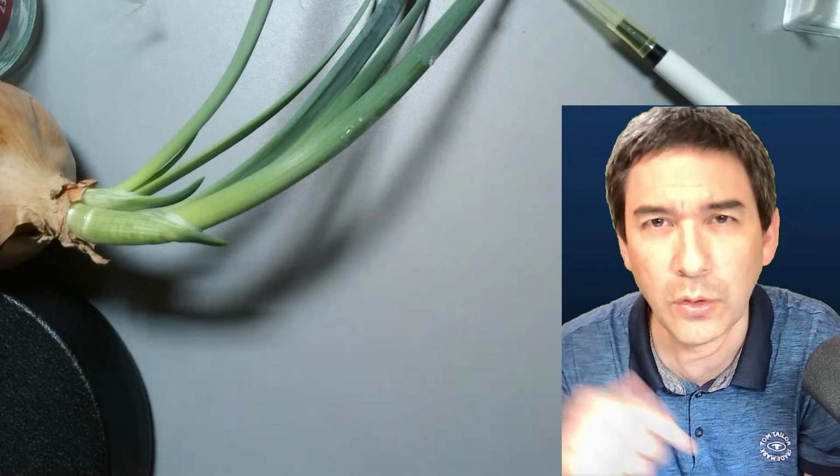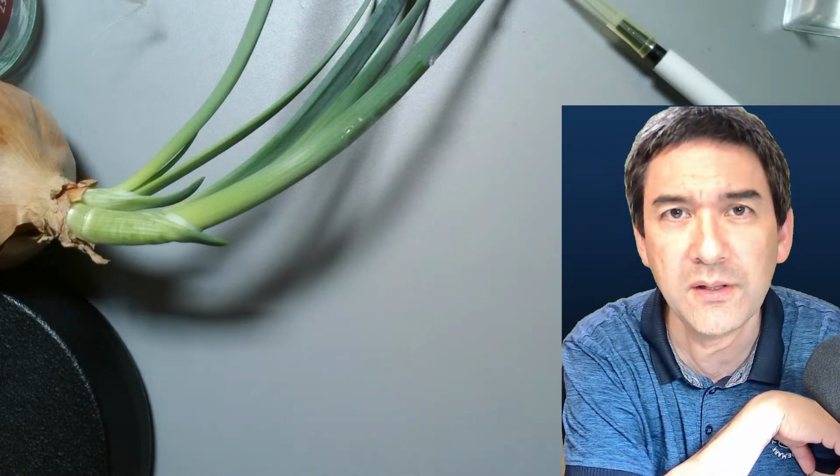Okay. What's a C-mount? A C-mount is a standard which is used for industrial cameras. Actually, it has a longer history than that. Yeah, but it is a standard for small size connections. Okay, you know what I'm gonna do, I'm gonna move on, if it's okay for you. And I hope I didn't forget anything because there are so many comments, which is nice.